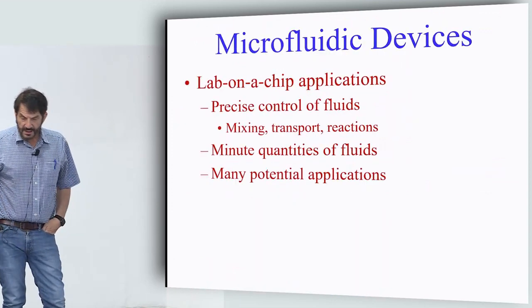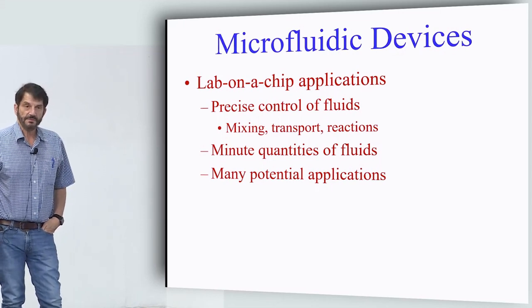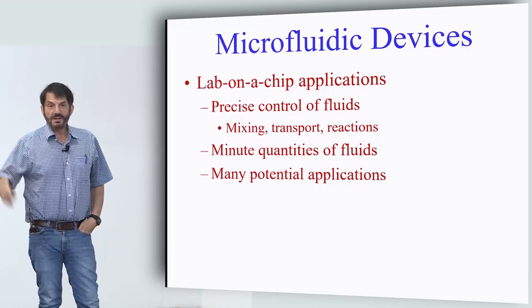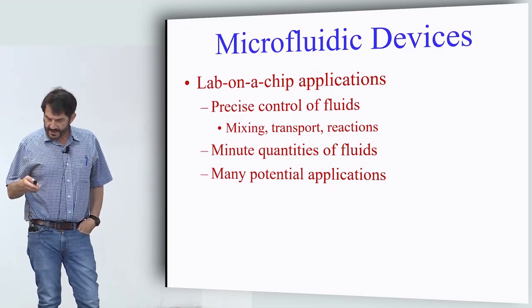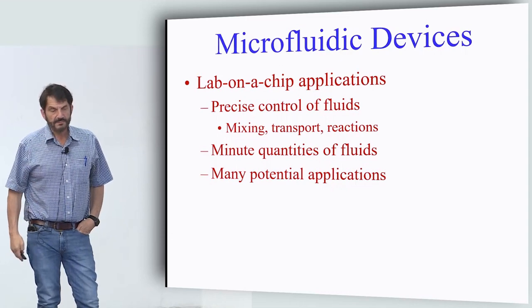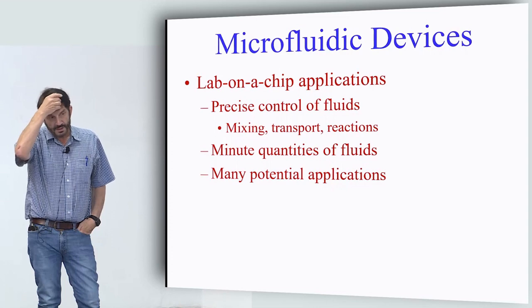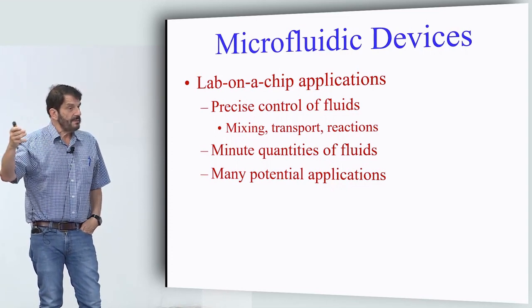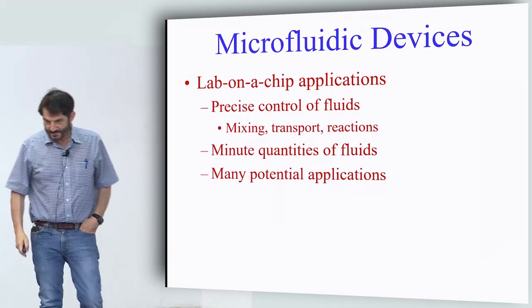So the last talk we heard about the applications of microfluidics for different organs on a chip, body on a chip, but mainly for diagnostics. And I would classify that as really all part of lab-on-a-chip applications. I always consider the lab-on-a-chip the dean's best friend. Somebody comes and says they need more lab space, and he says, well, just put it on a chip.